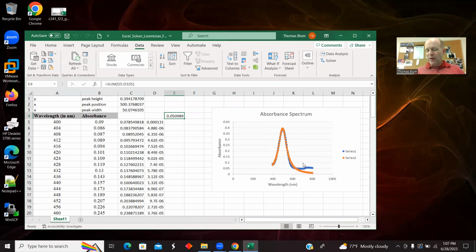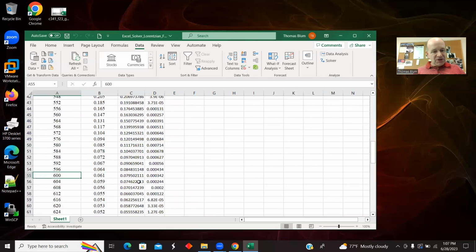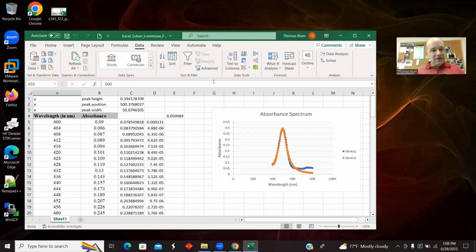Now you can play games and say, there's some stuff going on. I should have maybe cut off this peak at maybe 600 or something like that. So I could have taken this sum and said, oh, here 600 was 55. So I could have said, I'm only interested in going to 55, not 105, and repeated the process.